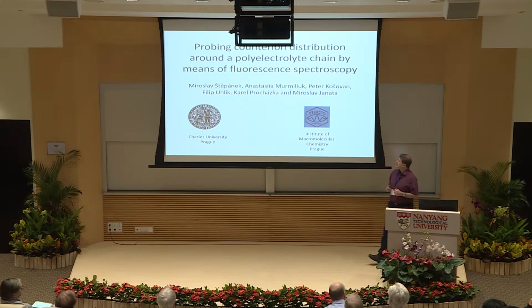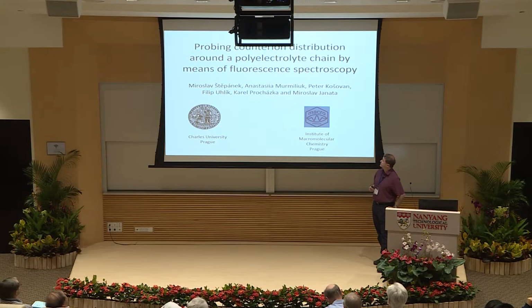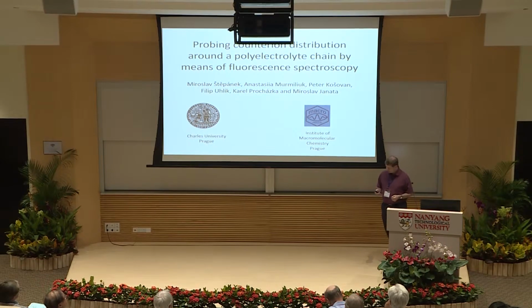reality. So we thought about what could be done in comparing their models with experiment, and since in our laboratory we use fluorescence spectroscopy quite often, and fluorescence spectroscopy is very good in assessing local properties on a nanometer scale, we came to the idea that we would perform this study, that we would try something very simple and very fundamental.